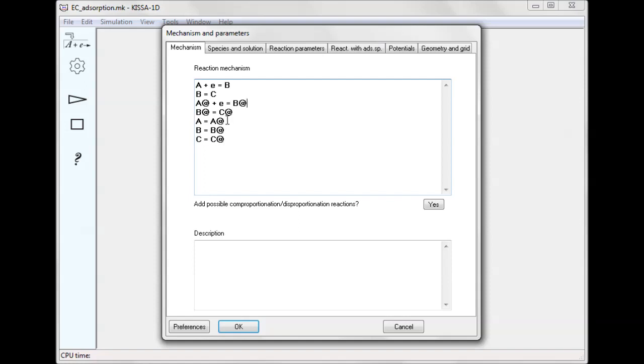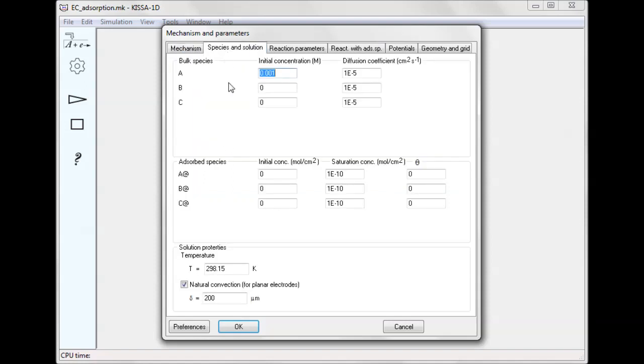If a species cannot dissolve, such a step can be made irreversible at a later stage. For solution species, one must set their bulk concentrations and diffusion coefficients, while for adsorbed ones, their initial and saturation surface concentrations must be defined.